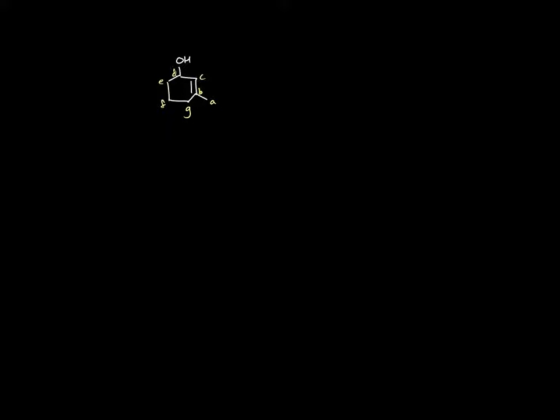But we would expect B and C, which are both sp2 carbons, these guys are in those carbon double bond carbon region, to show up somewhere between maybe 100 and 150 ppm. And this environment D that's right next to the OH, we would predict somewhere between 60 and 90 ppm. And all of the other ones should be somewhere in the range of 0 to 35.